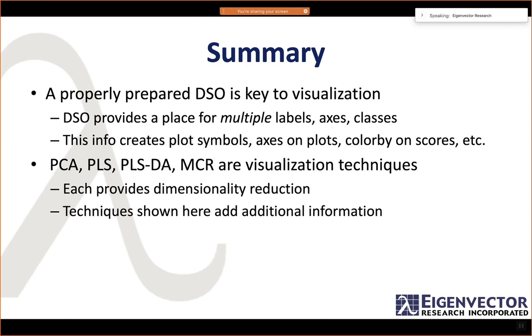And of course, PCA, PLS, PLSDA, MCR are all really visualization techniques in their own right. They each provide dimensionality reduction, and you can get that down to something that you as a human can deal with, going from many hundreds of dimensions down to just a few. And then the techniques we've shown here really add information to that.